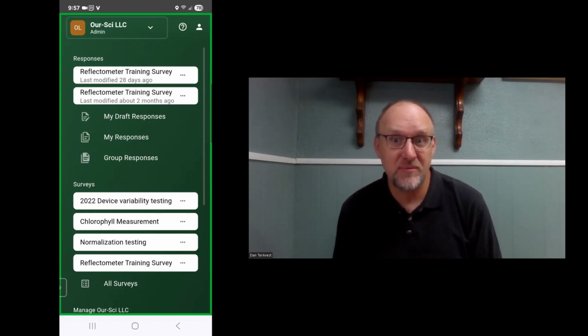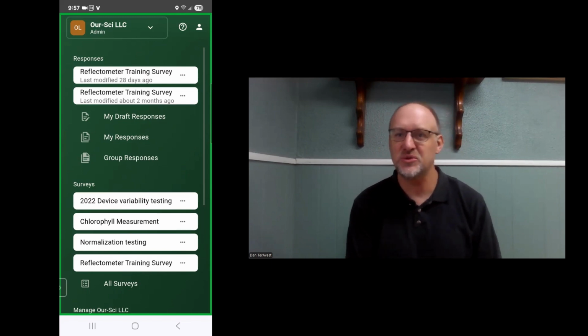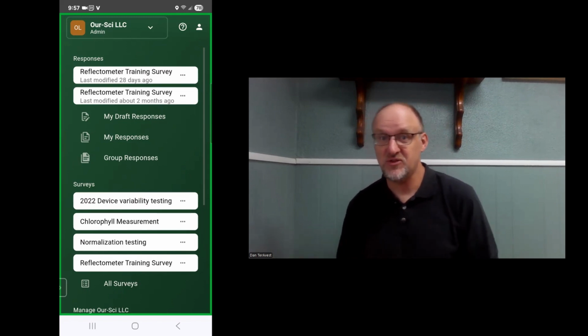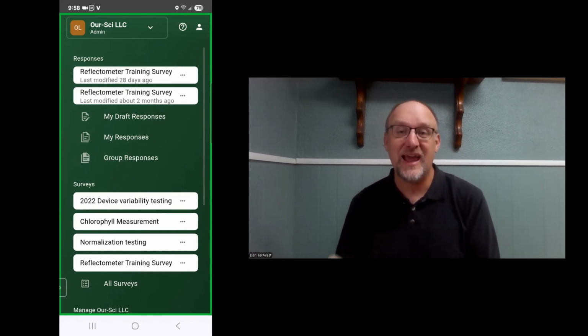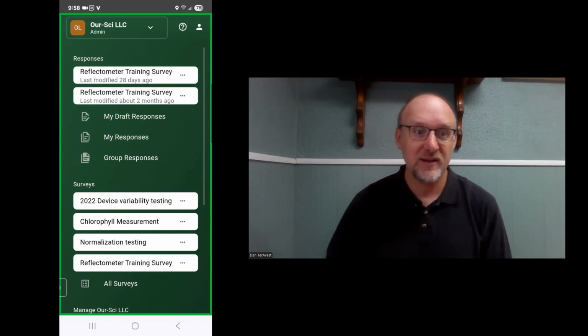But there may also be situations where you have to calibrate the device multiple times. If you start in the morning and it's cool, maybe cool and moist, and then you're working, and then you pause for lunch and you come back after lunch. Maybe you've traveled a distance. Right now, the weather conditions are different. It's hotter, it's drier. Then you may need to recalibrate a second time in an individual day because the inherent weather conditions have changed. So I'm going to walk through the calibration.